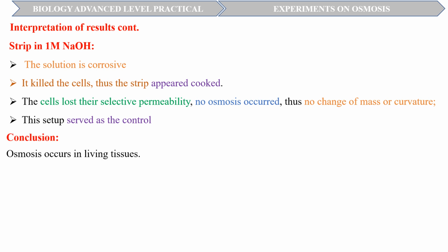From these results, we can conclude, with affirmation of our hypothesis, that osmosis occurs only in living tissues and not in dead tissues or non-living material like the cuticle.